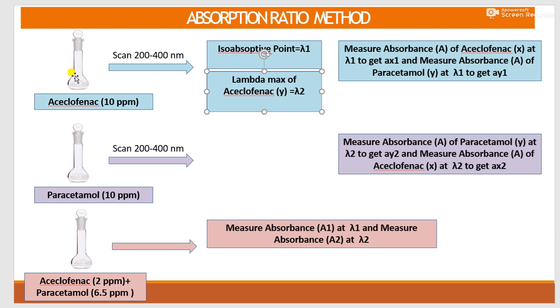I can take lambda 2 as the lambda max of aceclofenac, or else I can take the lambda max of paracetamol as lambda 2. Here I have taken lambda 2 as the lambda max of aceclofenac. Now, at this lambda 1 and lambda 2, I have to take the absorbance of both X and Y. Aceclofenac is X and paracetamol is Y.